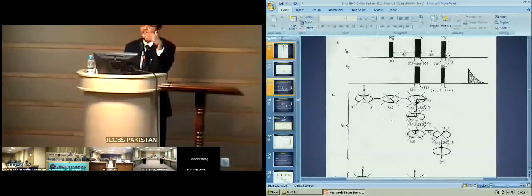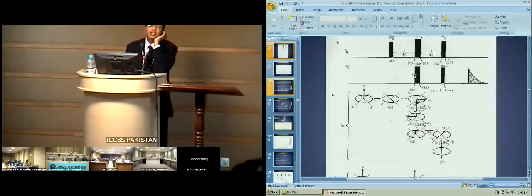So the consequences of different pulses are different. And they influence each other also. For instance, kindly remember that this pulse is influencing the carbon polarization. Right? And this pulse is influencing the proton orientation, divergence and convergence of signals.